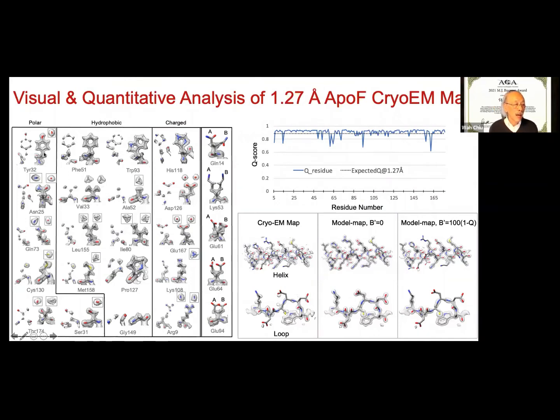The panel on the left shows the 20 different amino acids, each of them displayed in 2 contour levels. And interestingly, you can see the aromatic side chain is actually a hole like donuts. And then at the different contour levels, you can make out individual atom density.